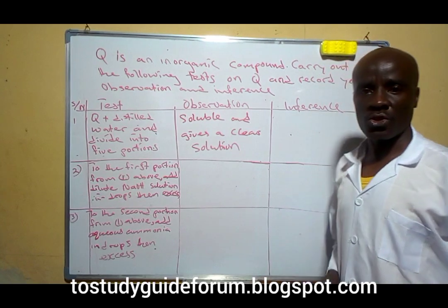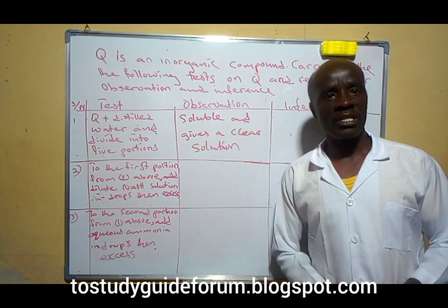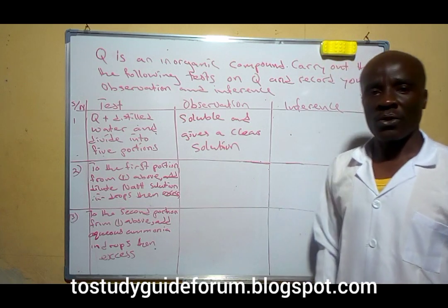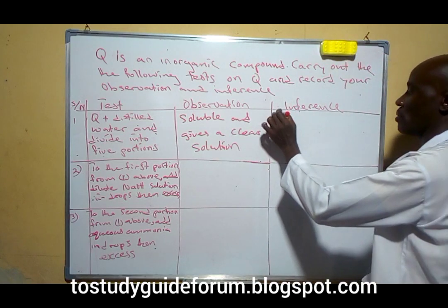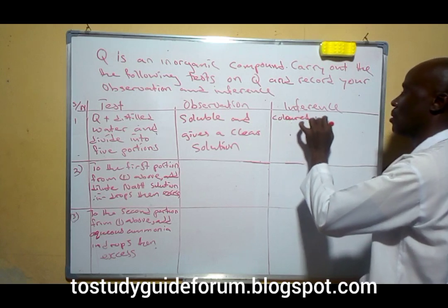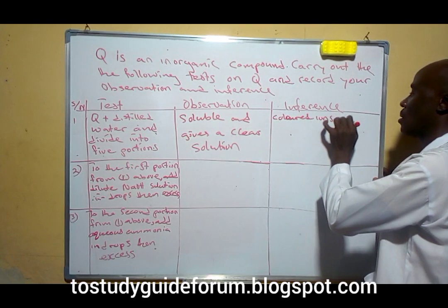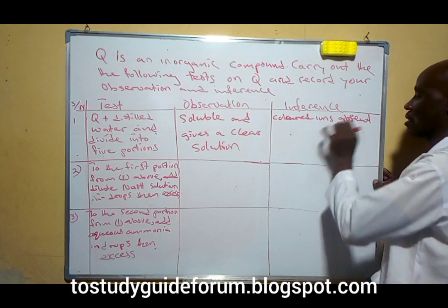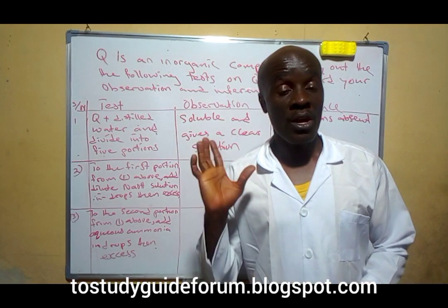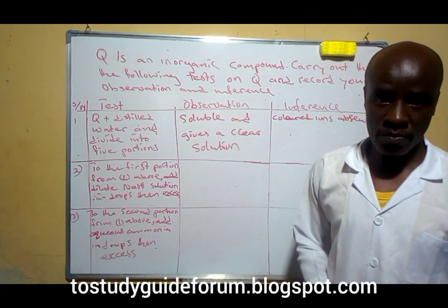The fact that it's a clear solution means that colored ions are absent.